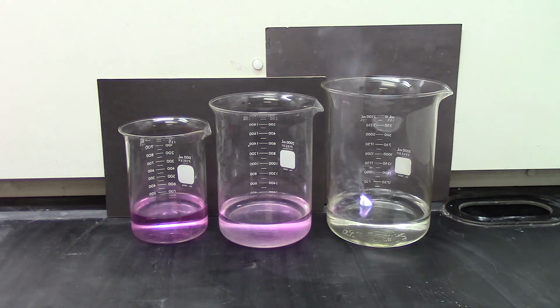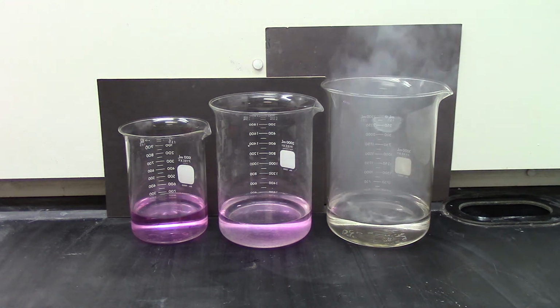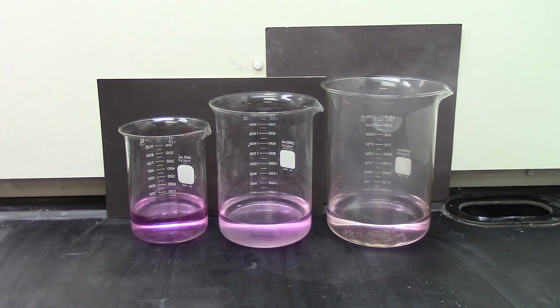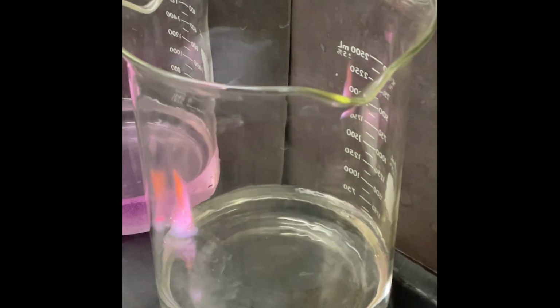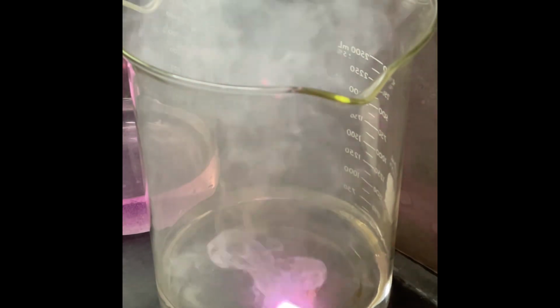Potassium is clearly the most reactive of the three. Even though it melts and floats like sodium, it generates enough heat that it actually ignites the hydrogen gas it's producing. The lilac color of the flame is due to atomic emission from the potassium atoms.